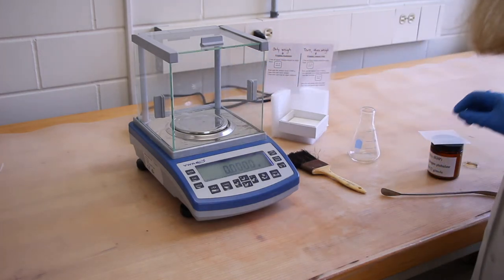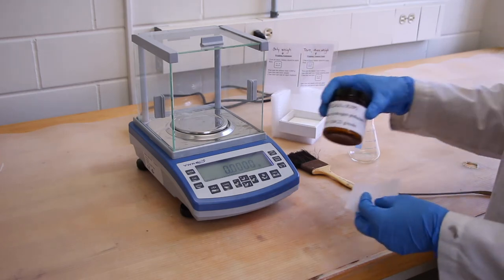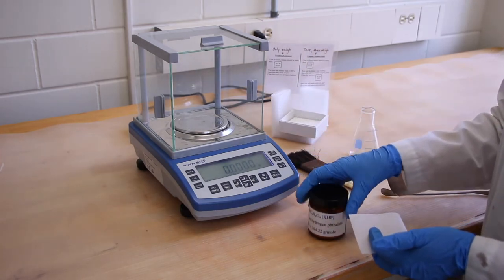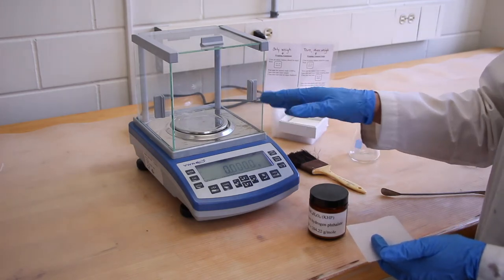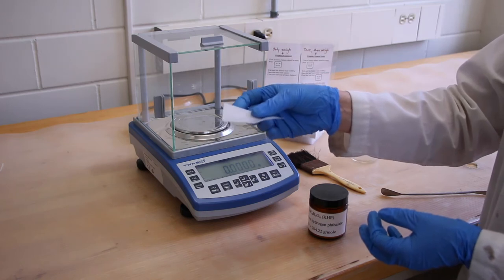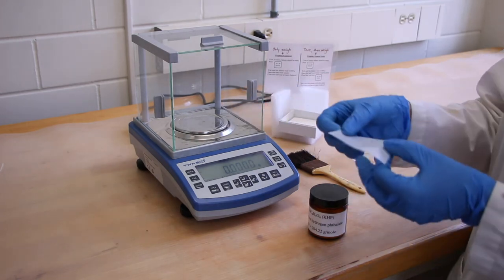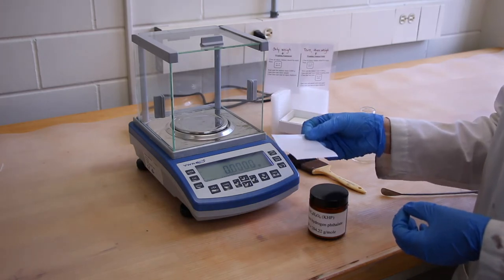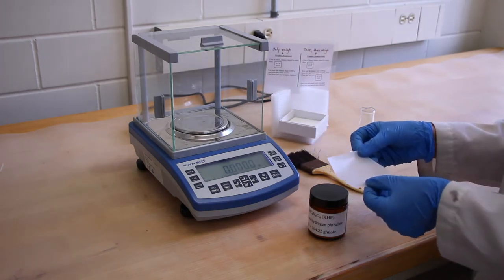The next type of weighing that we'll do is sometimes we'll have a solid that we don't want to put directly on the weigh pan, but we need to first put it on a piece of weigh paper. But we'll need to tare the weigh paper, which essentially is subtracting the weight of the weigh paper.